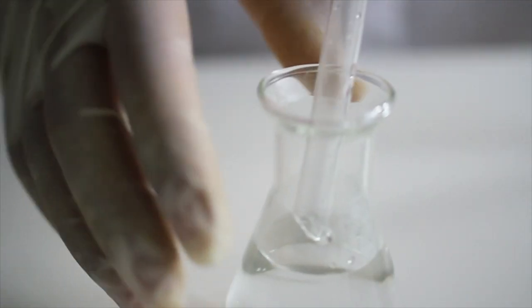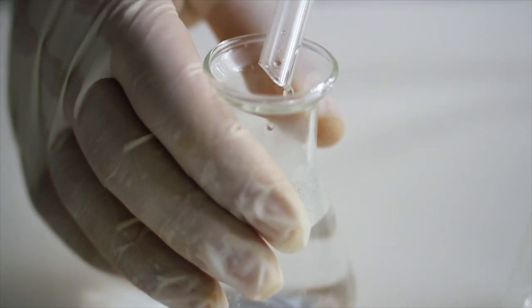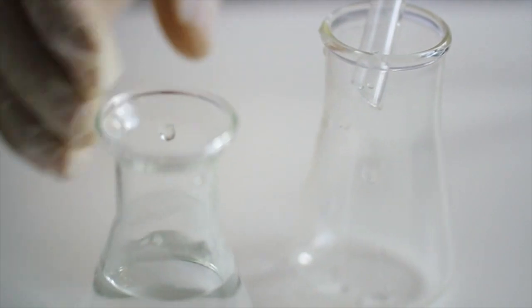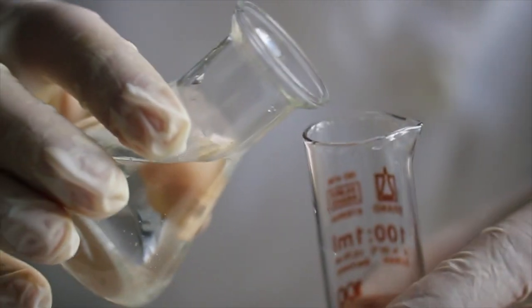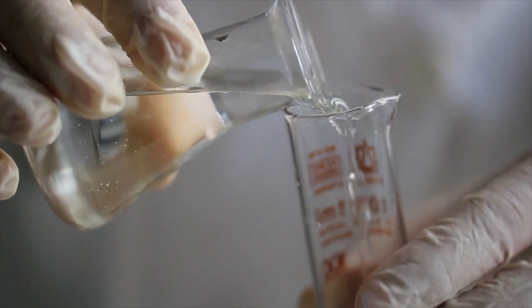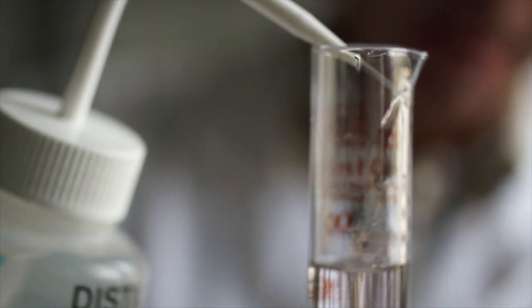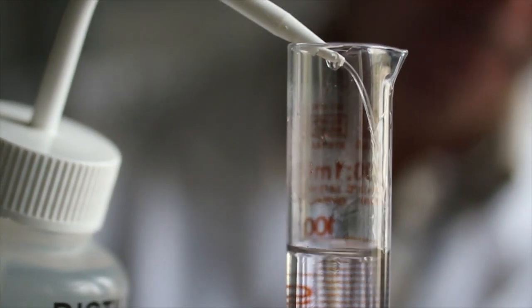Cando xa sabemos que todo o alcohol pasou a este colector, recollemos a mestura hidroalcohólica e pasámola a probeta. Temos que seguir engadindo auga ata os 100 ml, que era o volumen inicial de viño.